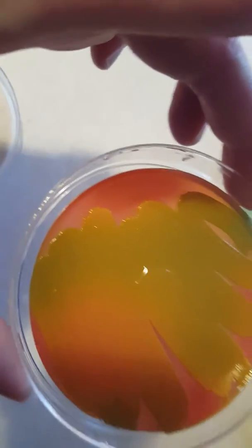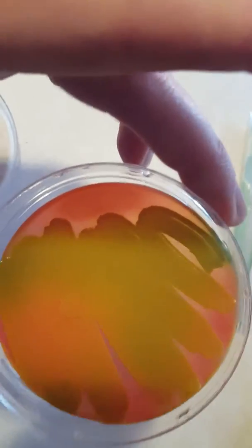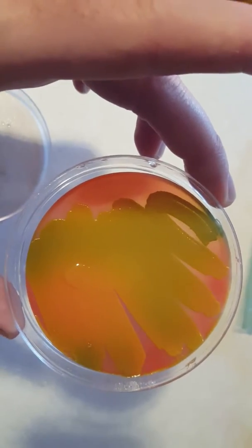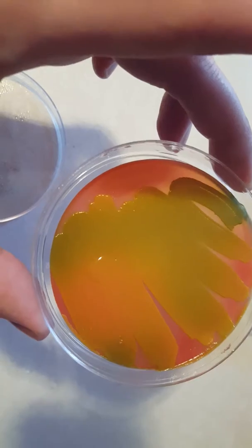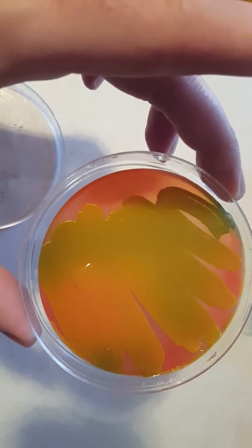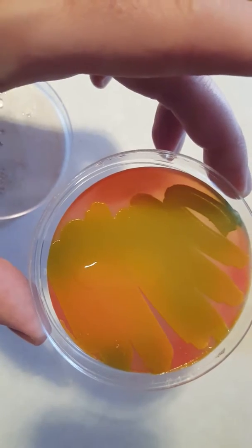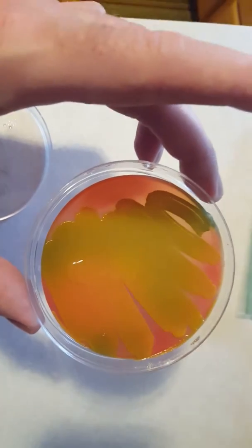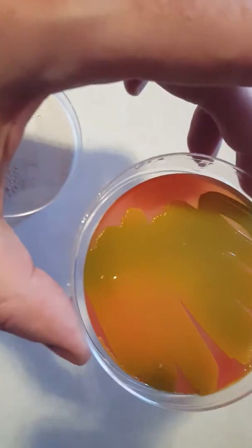This yellow and green bacteria — pretty cool. It's not salmonella, but it's some sort of coliform bacteria. There are hundreds of species it could be; I'm not sure, but it does not look like salmonella, thank goodness.